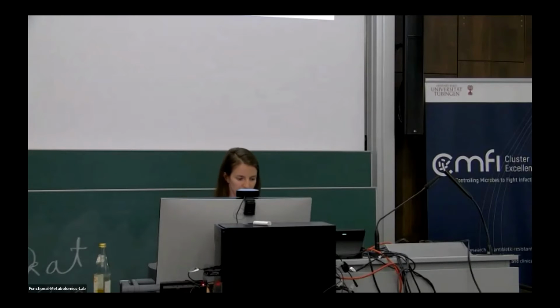Right. I will just quickly repeat the question for you, Justin. I will summarize, I hope that's okay. So we had just a talk from Kai about SIRIUS CSI:FingerID, where Kai also talked about substructures. So the question is, how does MS2LDA compare to SIRIUS CSI:FingerID? And would you suggest, if you have your own data set, trying both, or what's the advantage of one versus the other? I can quickly add, I will go into that a bit as well when I introduce MolNetEnhancer.